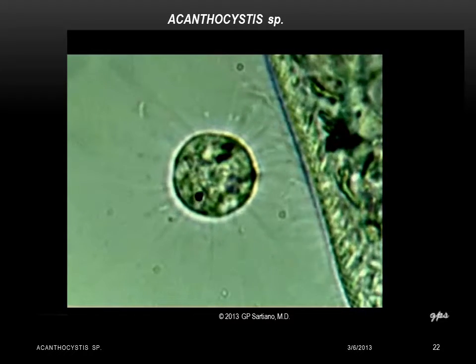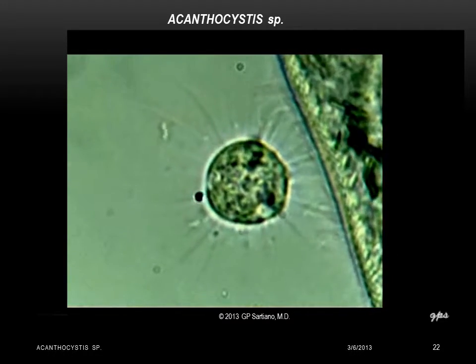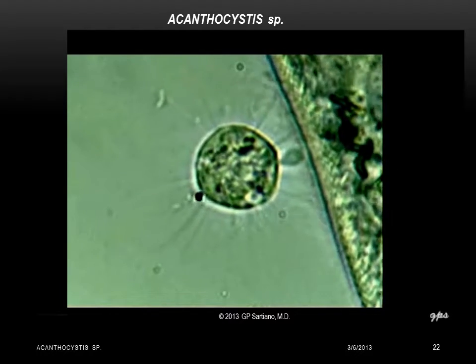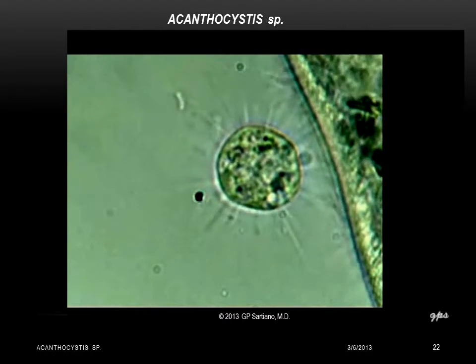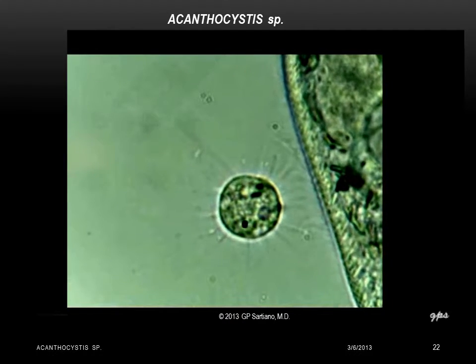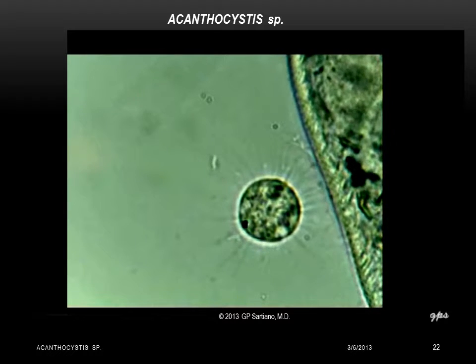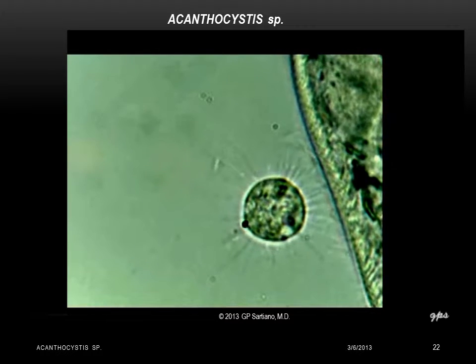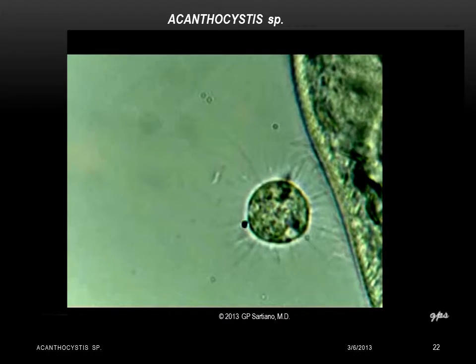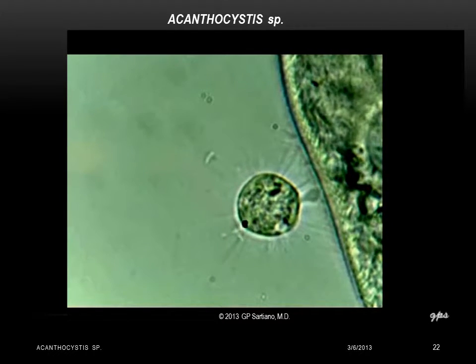In this video, the heliozoan closely approaches the side of a paramecium, and the heliozoan extrudes a cytoplasmic peduncle, which does not succeed in penetrating the paramecium's pellicle. The paramecium got away.